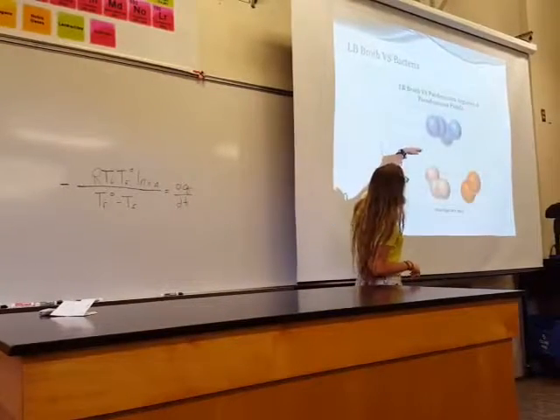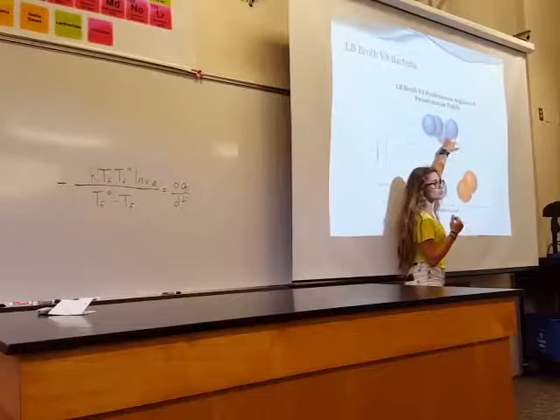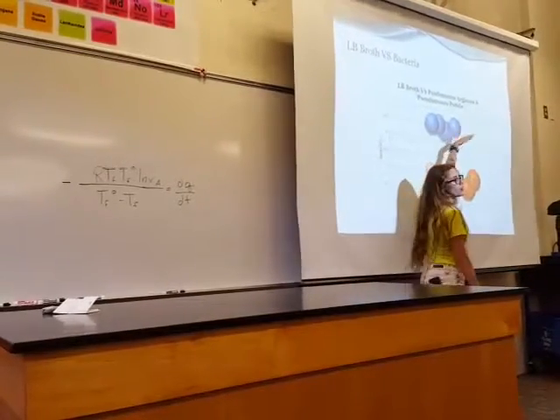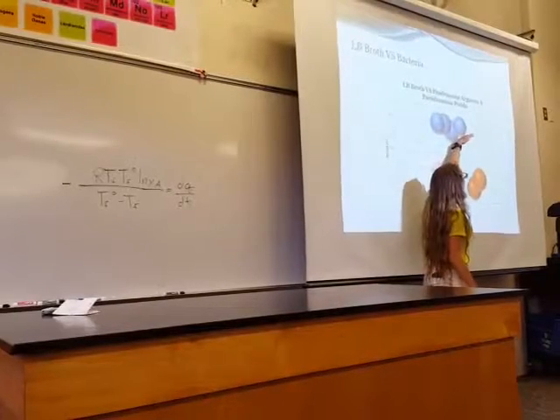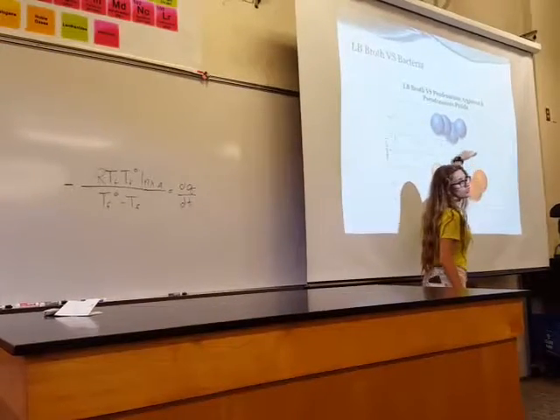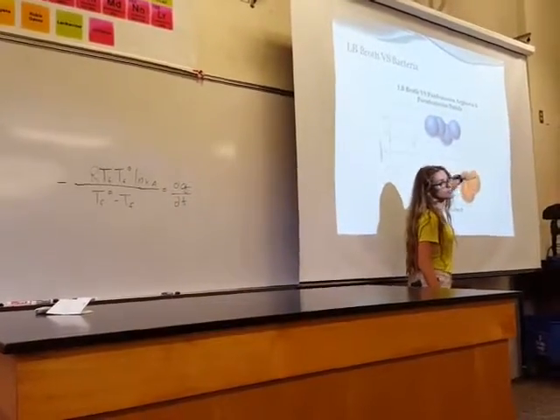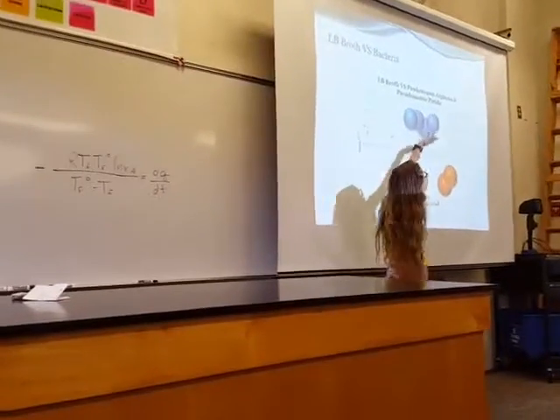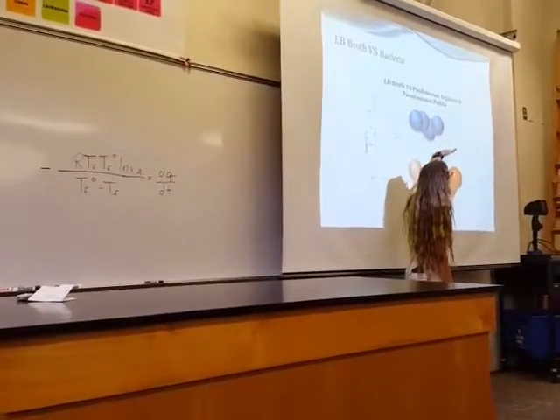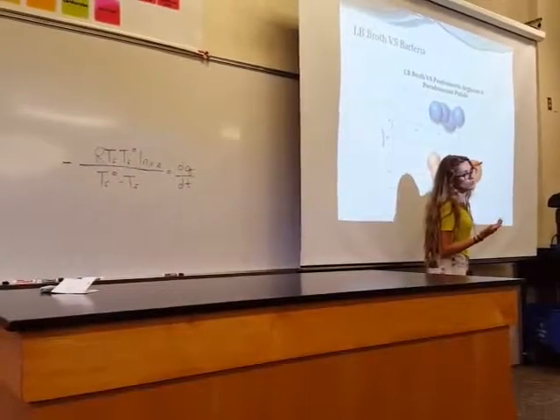If our background, the blood including the red blood cells, white blood cells, all of that stuff, was right here, or it could be over here, or wherever it would be, we would expect to see a shift towards the direction of the bacteria as the concentration of bacteria increases. If instead of moving all the way down here it moved right here, worst case scenario, you run it again and it moves further down.